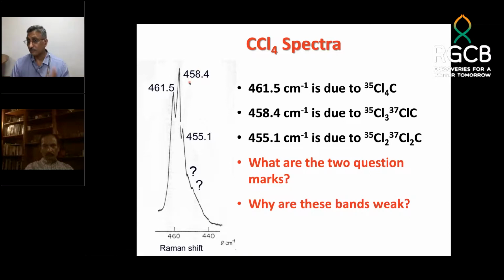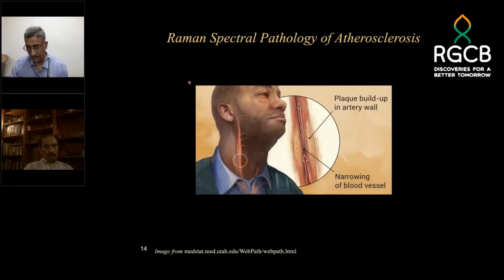That is it. Now from this, in biology, it is very, very easy, because if I deuterate my sample, that means if I change labile hydrogen to deuterium, it is a heavier atom, so my peaks in Raman should shift to a lower frequency. This is very useful when I am looking at amide bands and many other things. Similarly, I could substitute carbon or oxygen or nitrogen with a specific isotope, and in a complicated molecule, I can look for frequencies from a particular region. So the isotope effect is a very important thing.